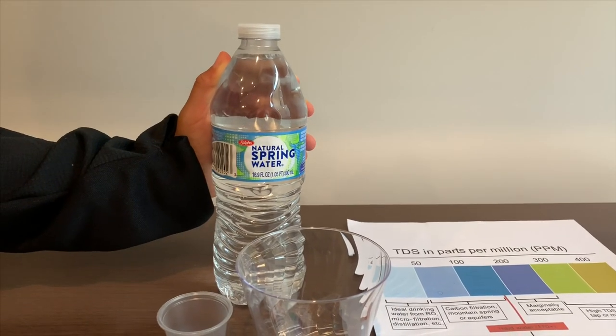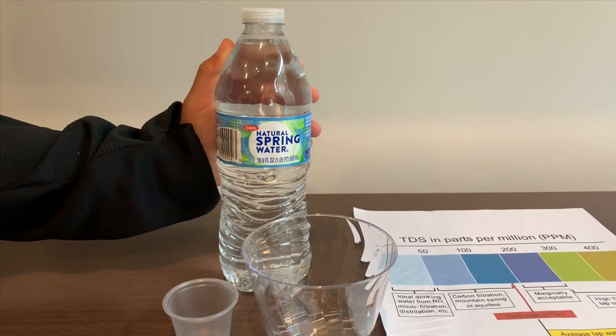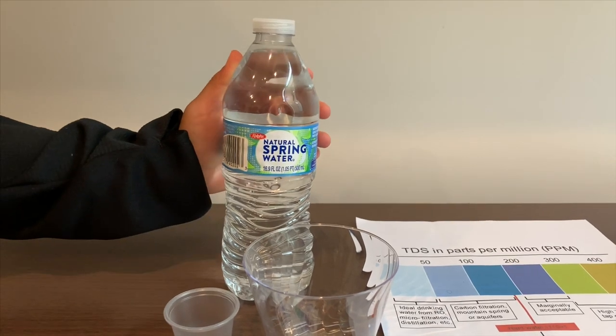This is Ralph's Natural Spring Water. It starts from California. Let's test the pH and TDS levels.